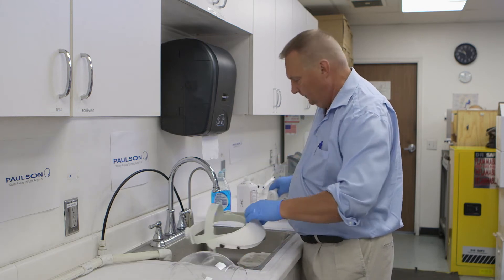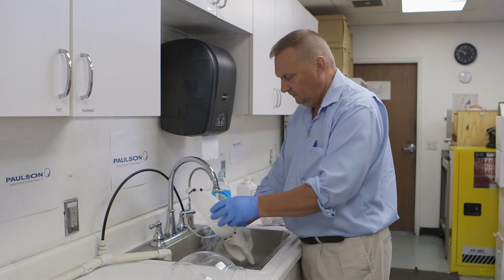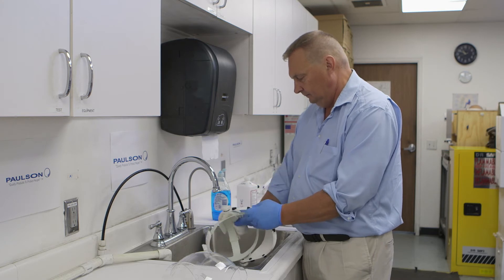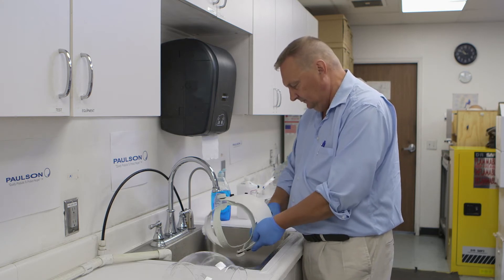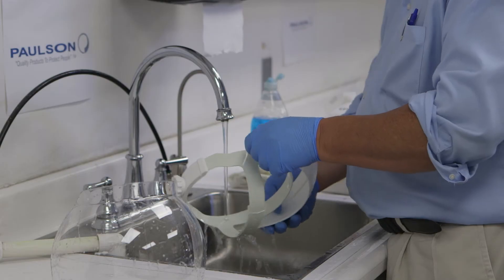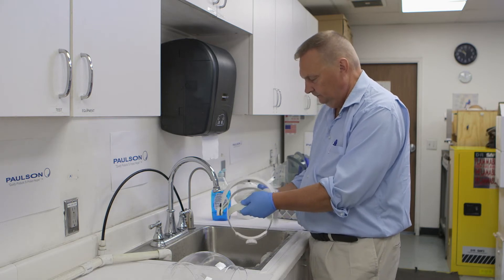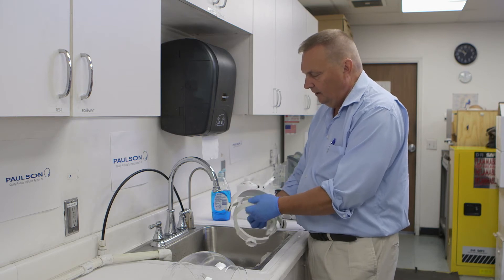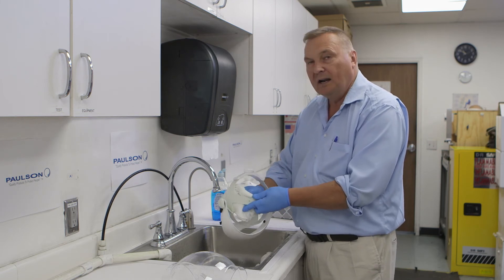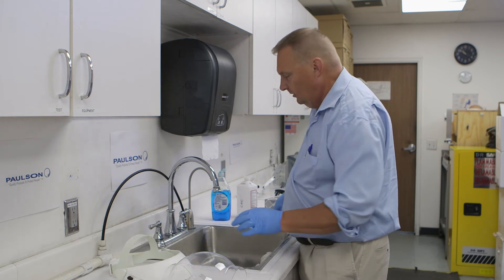Take the headgear — same procedure. We're going to rinse it, wash it with the detergent rag inside and out, rinse it, and pat dry. We don't want to cross-contaminate our washing rag with our drying or alcohol rag, because we don't know what kind of debris is on it — for example, there may have been blood splash on this type of product. The product is now considered cleaned.